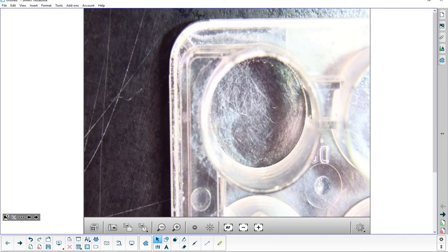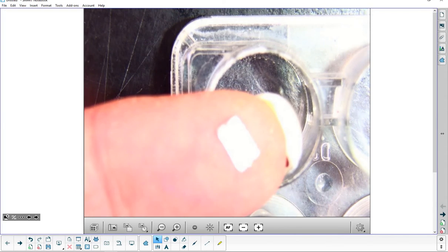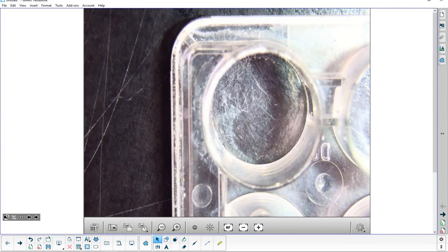For this one, we're going to use concentrated hydrochloric acid, and you can't see it. And we're going to use magnesium ribbon. So you'll be given a strip of magnesium ribbon, and you've got to decide how many trials you're going to do, how much magnesium ribbon you're going to use for it. I'm just going to use a small amount, about that big. Okay, so that's my fingertip. It looks awful under that.